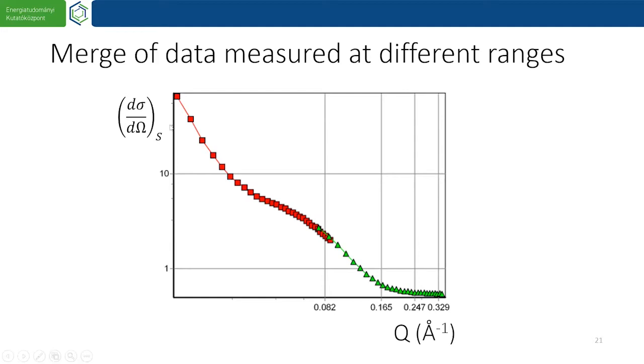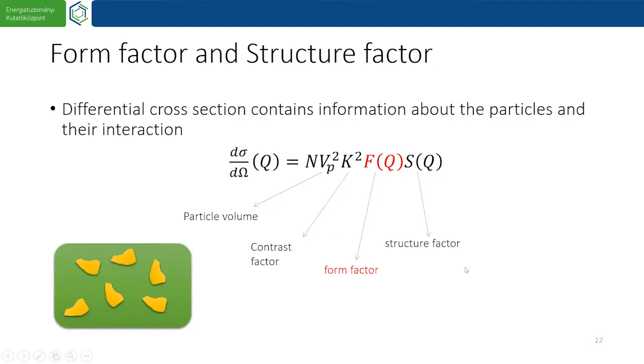The sample which gives this scattering picture is a modified silica gel, a xerogel. Please ask questions, because now some more difficult parts will come, some mathematics.